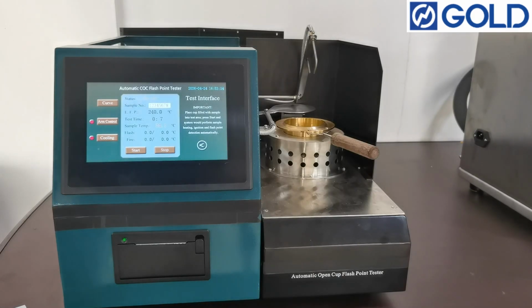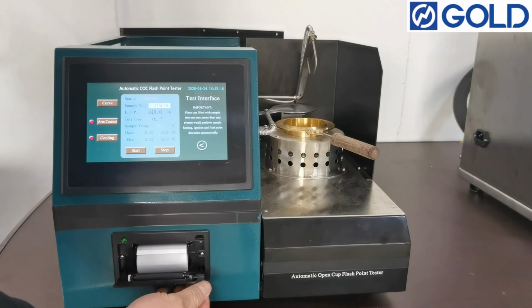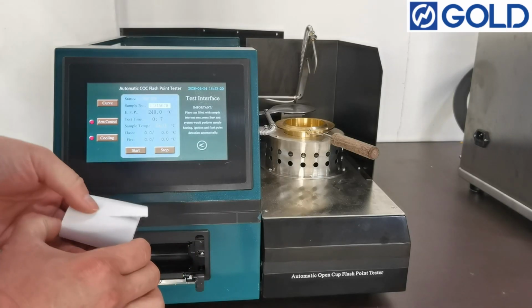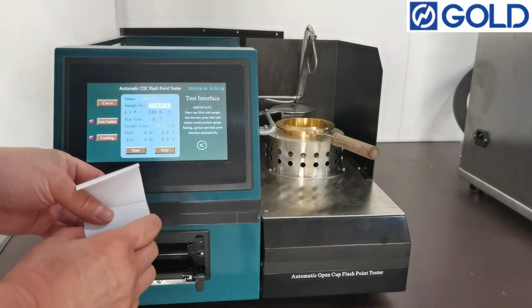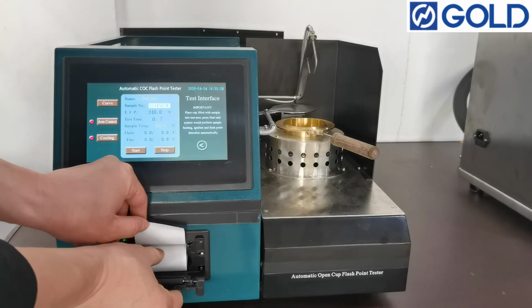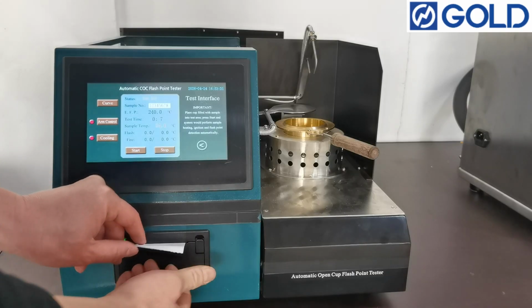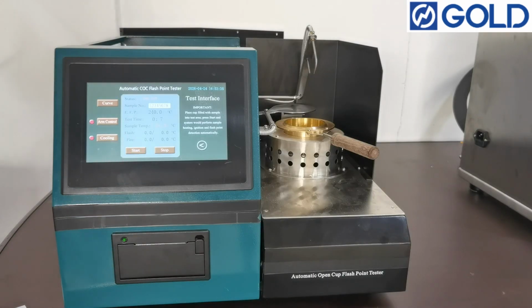To change the printer paper, open the printer. Place new printer paper like this. Then close it. Pull it out slightly. Peel it off. That's it.